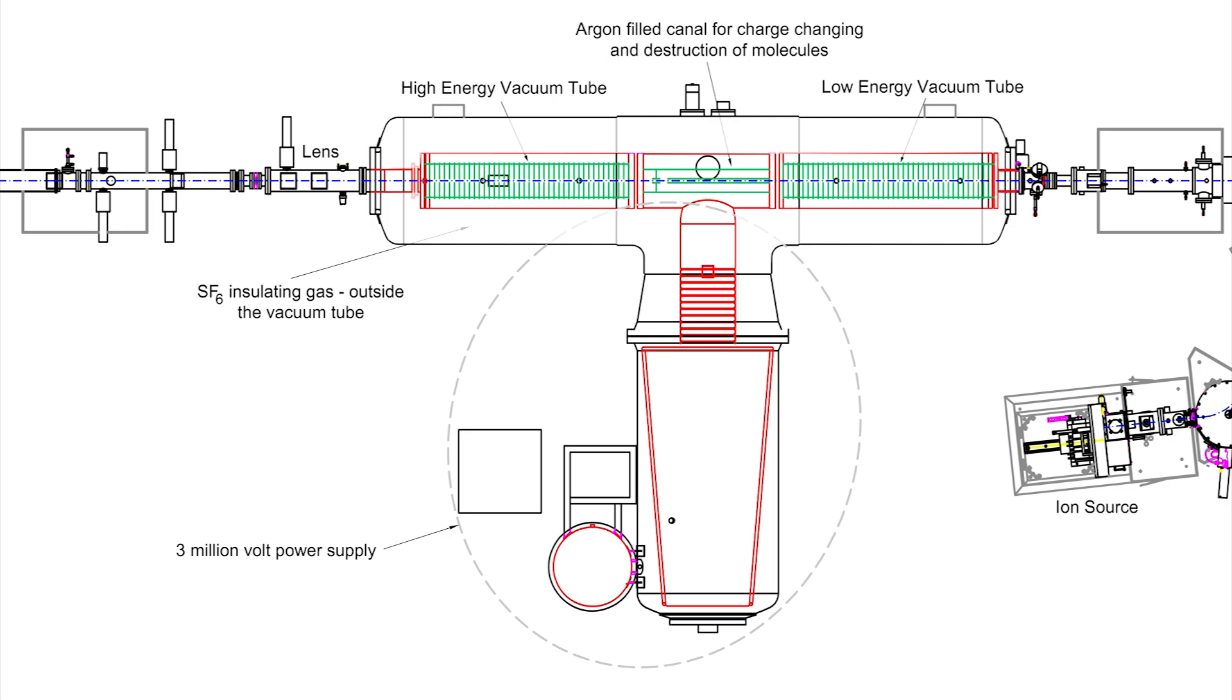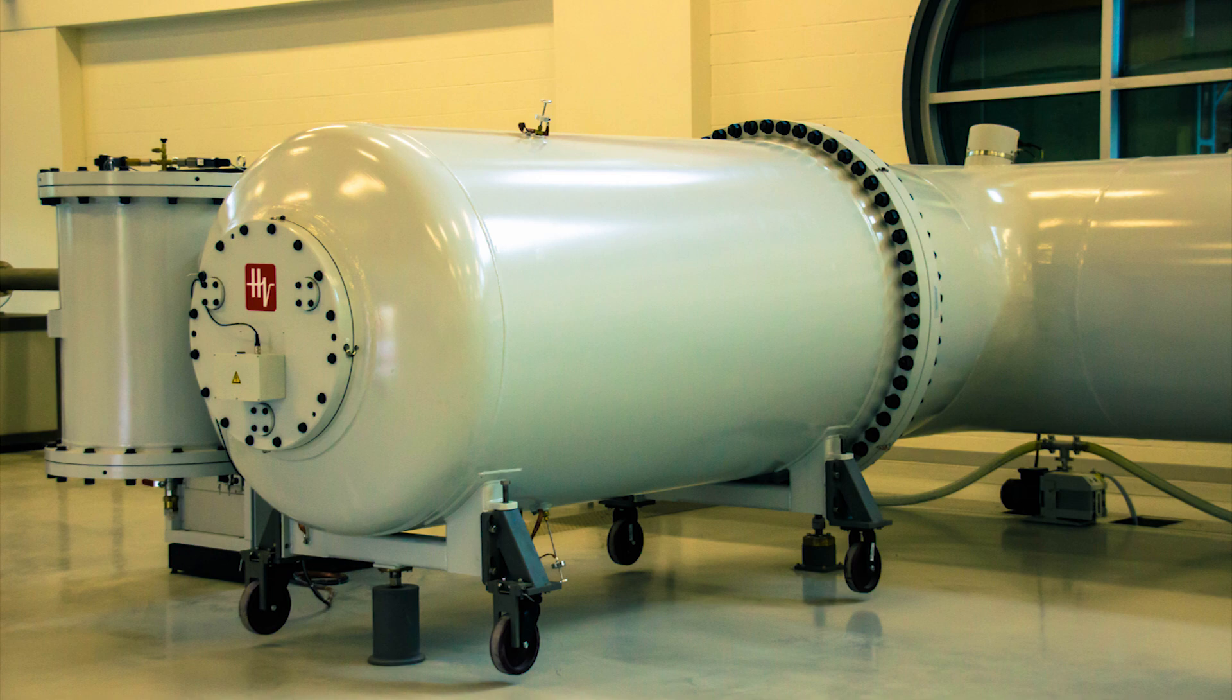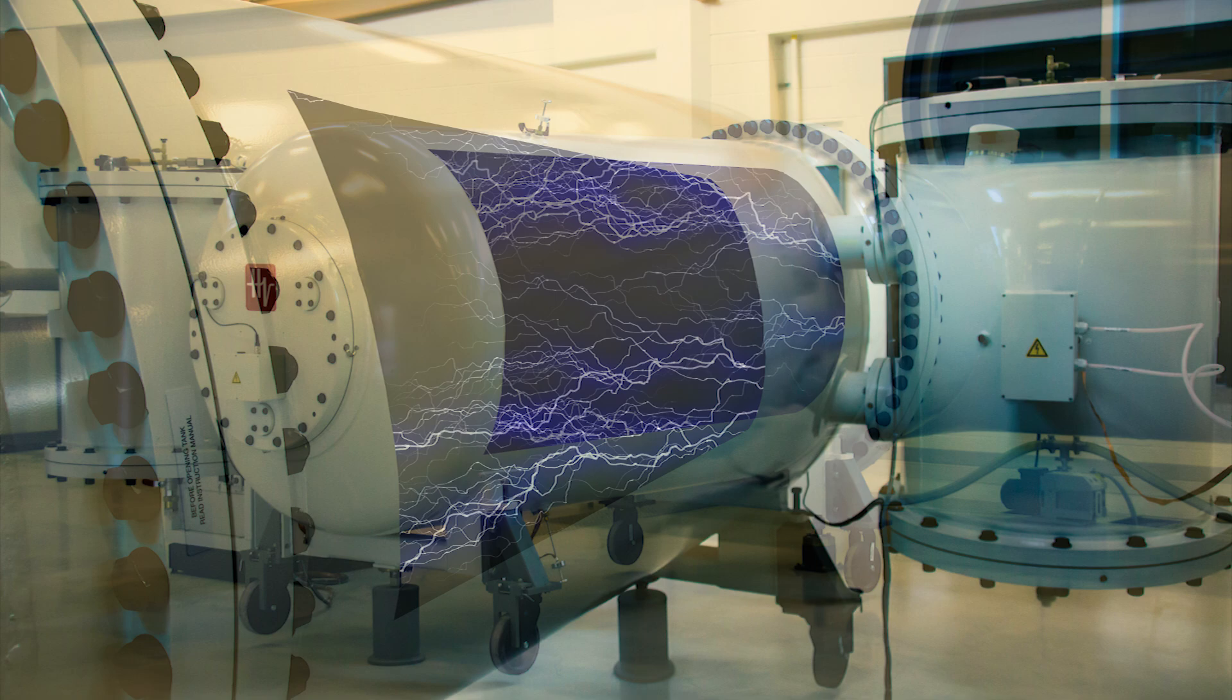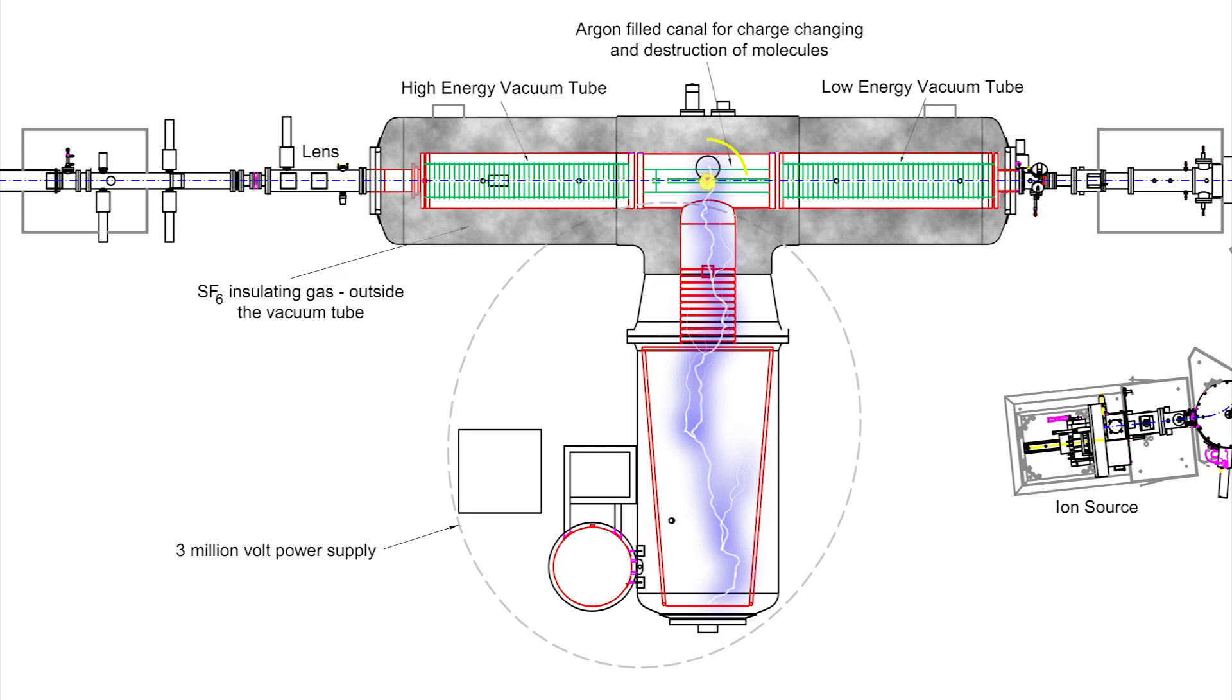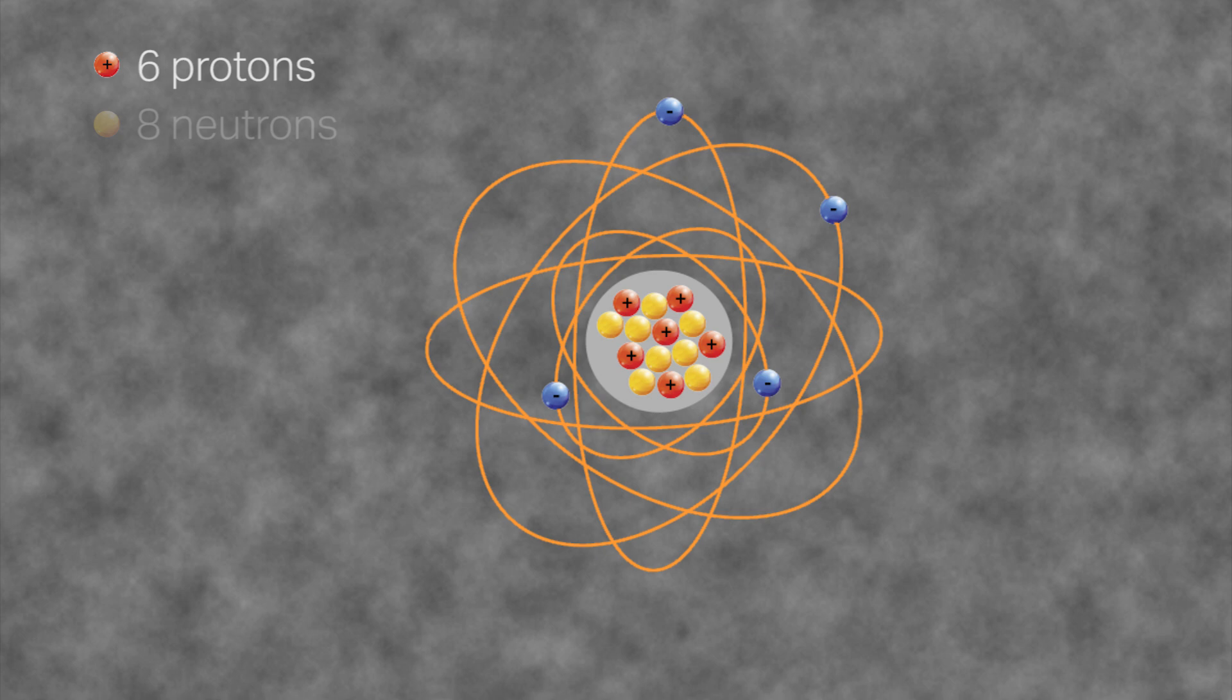We're looking at a tank right here. It's a T-shaped tank filled with insulating sulfur hexafluoride, because we're going to create a huge voltage in that tank. It's like a big transformer that you see in hydrosystems, except ours is 3 million volts. So we're going to race those ions towards that positive pole, and then we're going to switch them. We're going to strip those electrons off carbon and turn it to a positive ion just as it hits that positive pole.